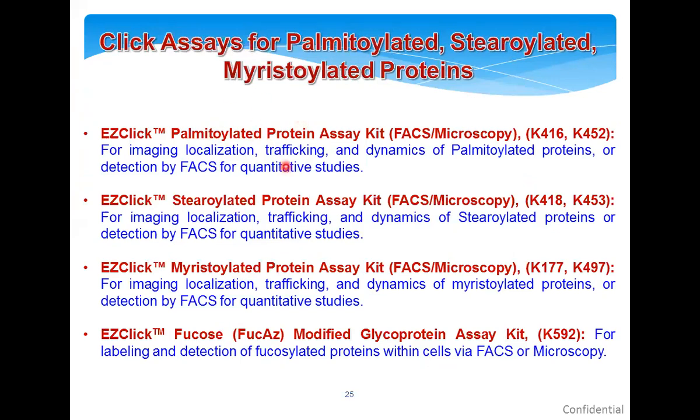In palmitoylation, you use a modified, cell permeable palmitic acid. You feed it directly into the cells and it gets incorporated into the proteins during or post-translation. Then you study the palmitoylated protein by FACS or imaging.